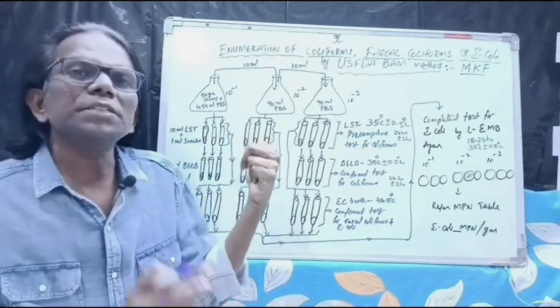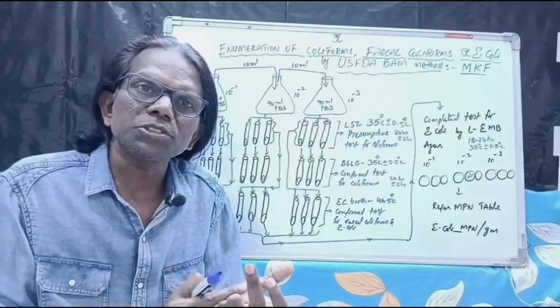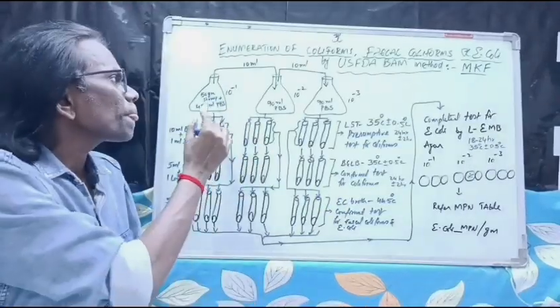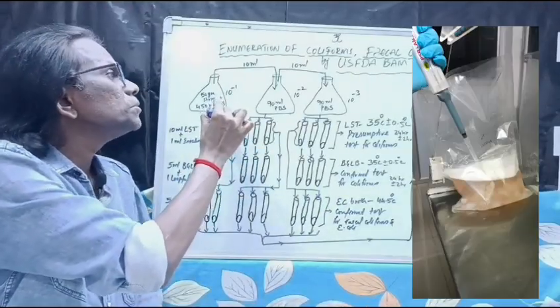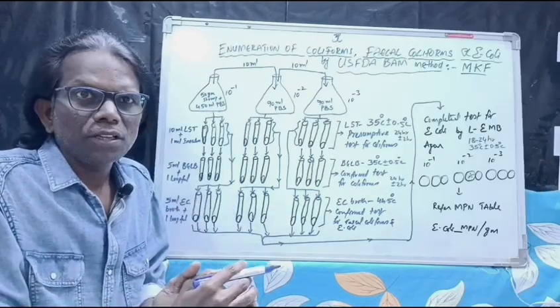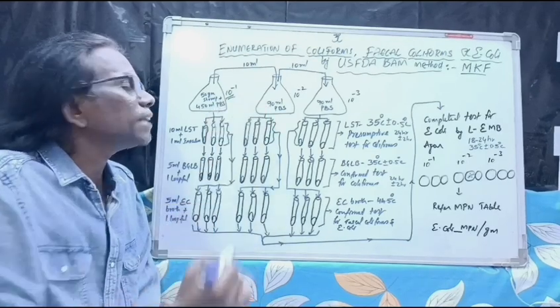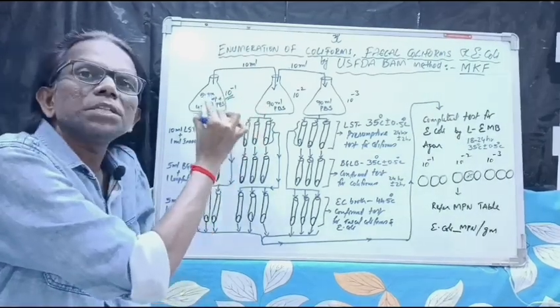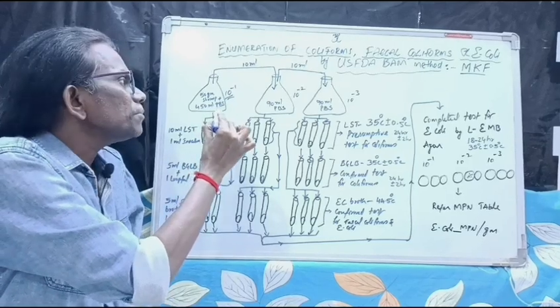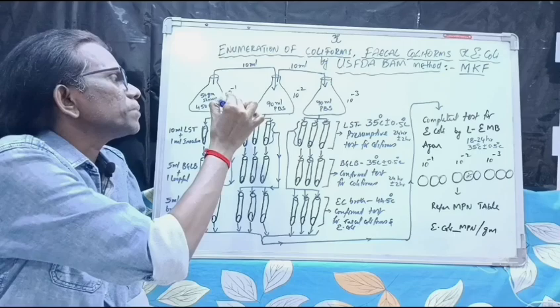This is the procedure. For the analytical unit as per FDA BAM, we take 50 grams of meat or shrimp sample and dissolve it in 450 ml of phosphate buffer solution. Blend for 2 minutes in a stomacher blender. This gives rise to the 10 to the power of -1 dilution. So 50 grams of shrimp sample dissolved in 450 ml of Butterfield phosphate buffer solution gives 10 to the power of -1.